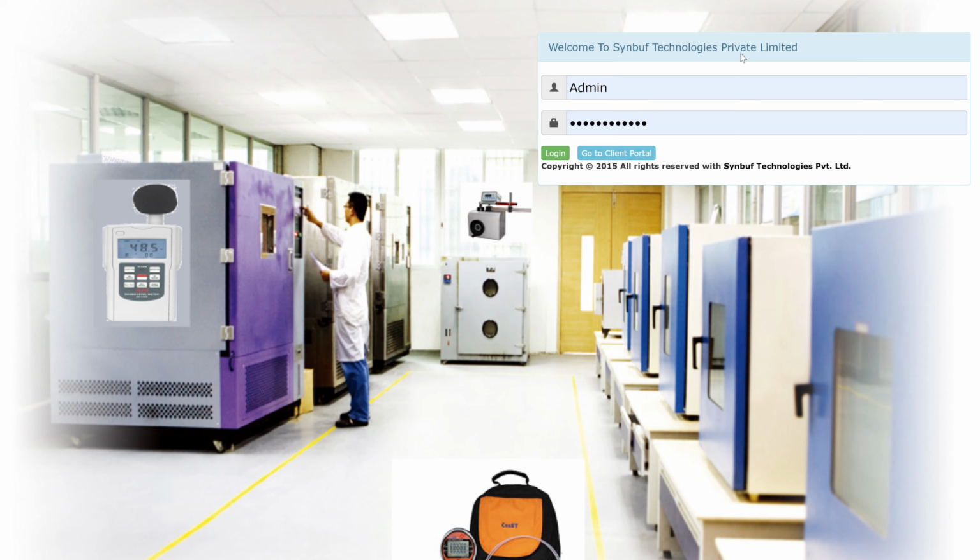Welcome to the software called Calsynbuf, which is specially made for calibration laboratory operations management. The best thing about this software is that it is web-based and multi-user, so many people can work together. Data can be synchronized and is accessible to all your employees. It's a completely secured application. Let's see what this application is exactly.